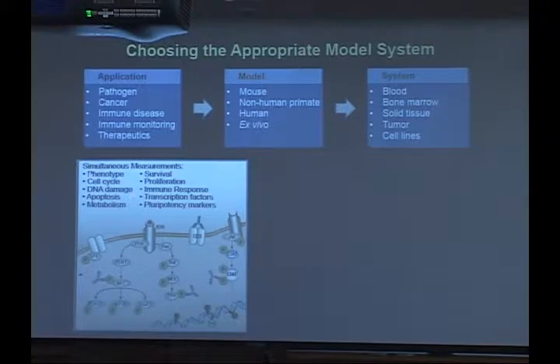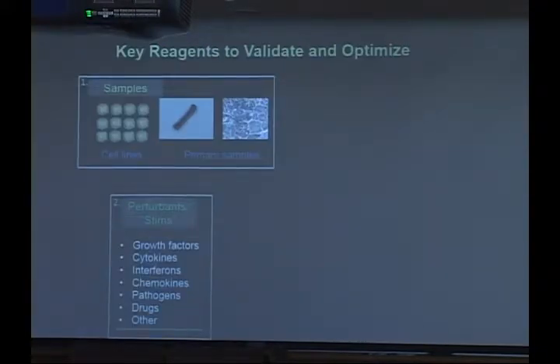And one thing that I've always been very intrigued about was the fact that with the cell cycle, you can delineate all phases and you can actually find out what is happening in those phases. And I'm sure Greg is going to talk about that more tomorrow. Well, he will. So your antibodies can be divided into two sets: ones that recognize extracellular proteins, as I mentioned, to delineate specific cell subsets, and intracellular proteins that can tell you about cellular function.